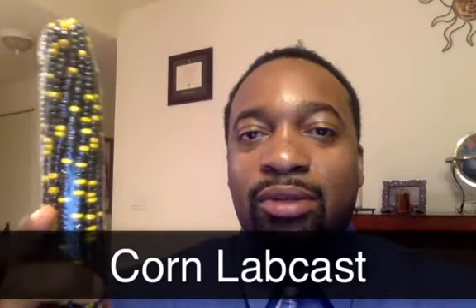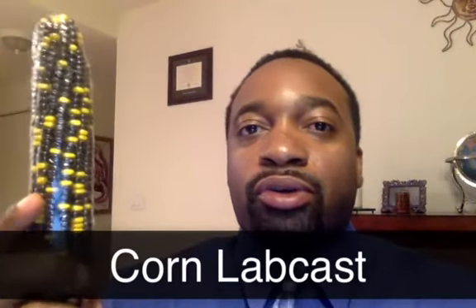Hey gang, you might be wondering why I'm holding this corn on the cob. We are performing the corn lab this week, and we're looking at the genetics of the color of corn. If you look closely, you can see that there's yellow and sort of this purplish color, and you may or may not know that in corn, these individual kernels here are actually individual offspring.